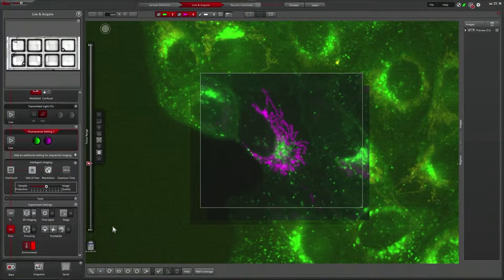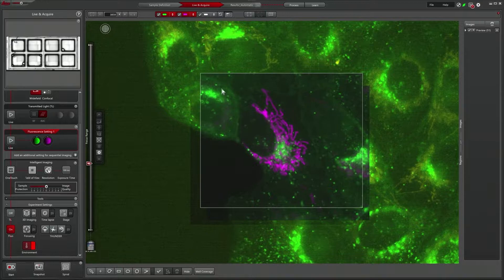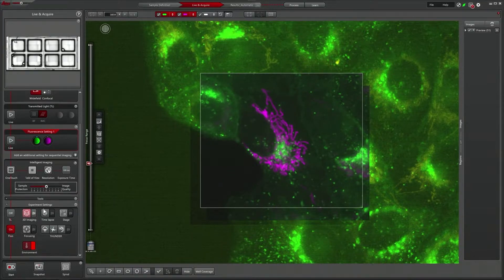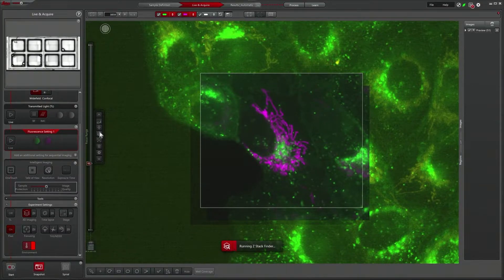How do you set up a 3D time-lapse experiment? Select the cell of interest, activate 3D imaging, and first of all run the ZStack Finder to specify the volume that you want to image.